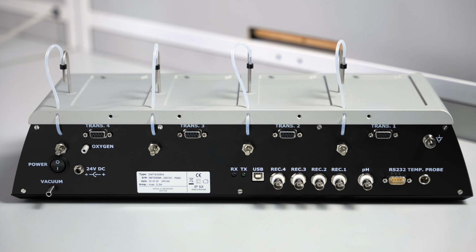There's a port that will only be used for diagnostics testing in the workshop. There's a plug for a temperature probe. And lastly, there's a grounding post which will be used to eliminate any electrical noise.